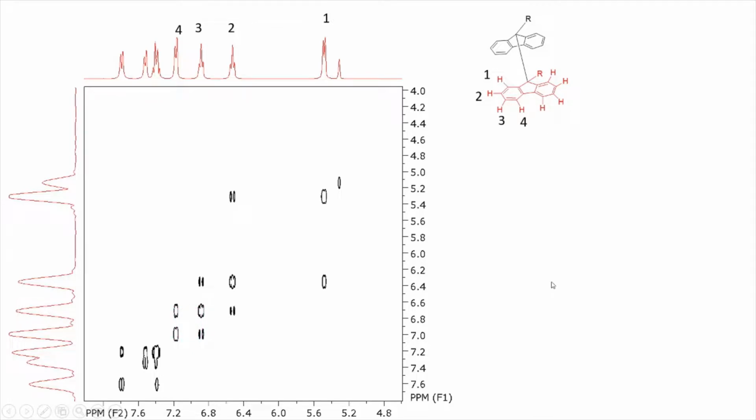Now for the next ring, you are saying 6 and 7 here. Why am I putting 6 and 7, why not 5 and 6? 5 could be there. 5 is a doublet, and 8 also will give you a doublet. So there are two doublets there, and 6 could be a triplet, 7 could be a triplet, and they are very next to each other. That's why they give a merged proton peak. So still it is not good evidence.